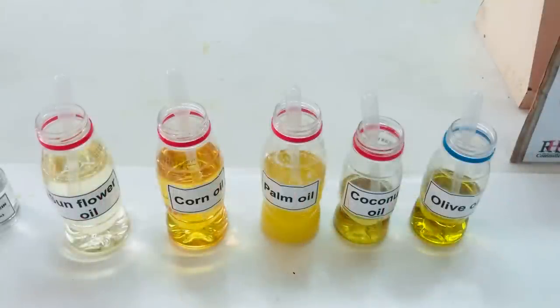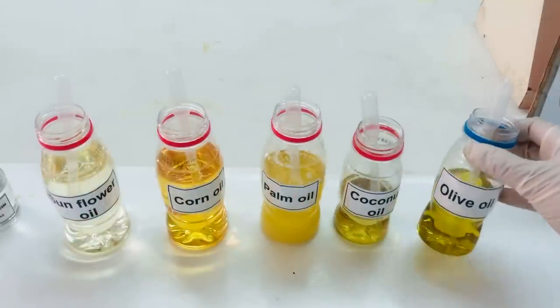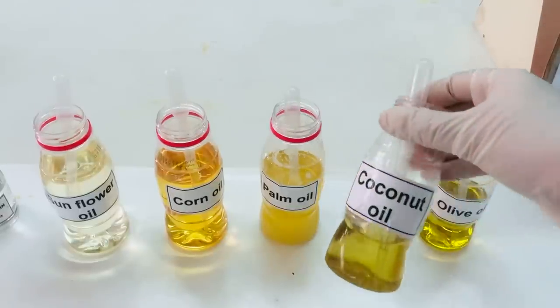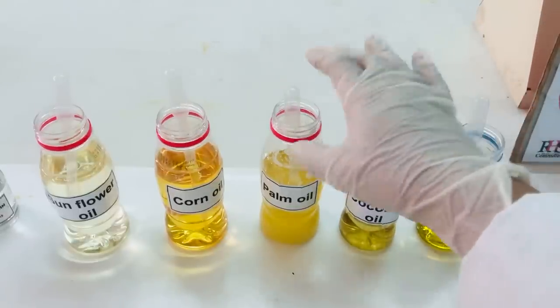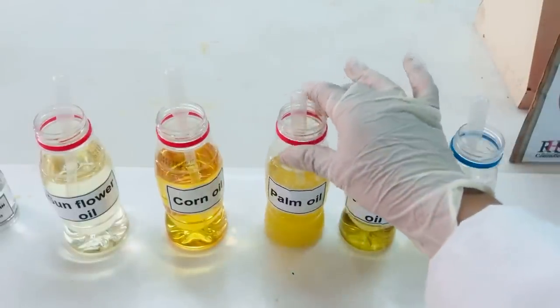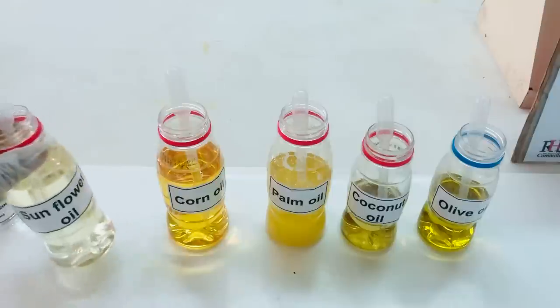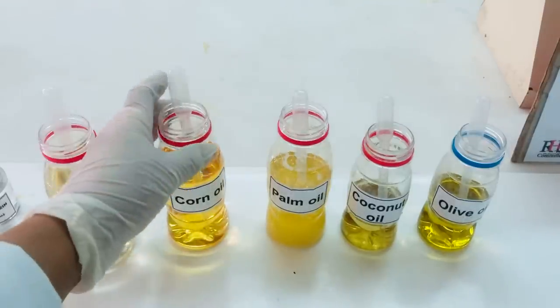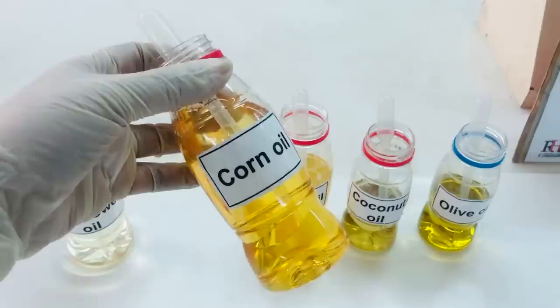The oil samples that we are going to use in today's experiment are olive oil, coconut oil, palm oil, sunflower oil, and corn oil.